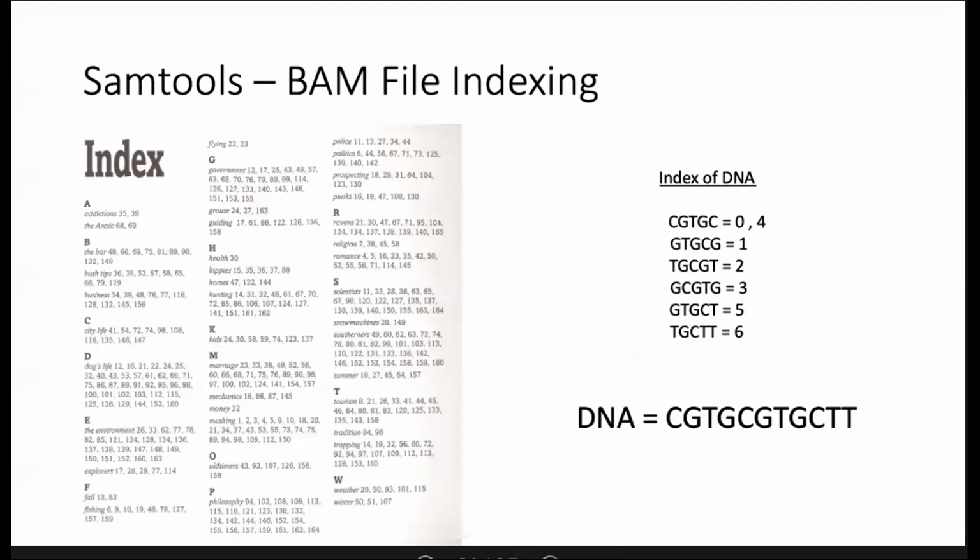So far we've reduced the computational workload by making the SAM file machine readable, by converting to a BAM file and sorting the data. However, more can be done to further reduce workload, and this is through indexing. Indexing a genome serves to further facilitate the retrieval of sequences and their mapping.